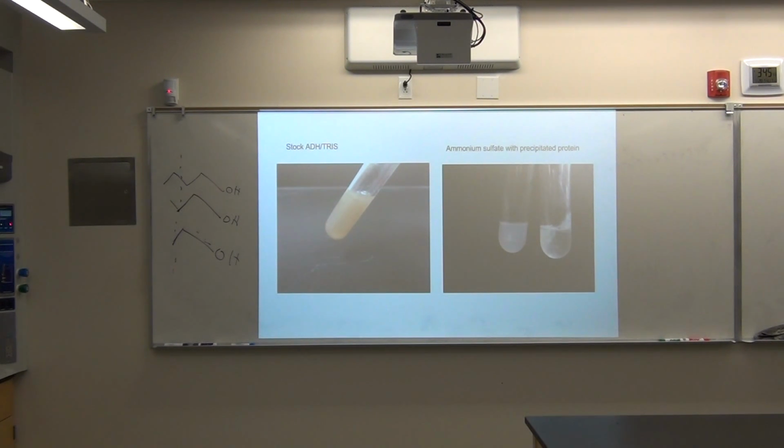That's why we have to run it in a refrigerated centrifuge, because the sheer friction of spinning at 19,000 times G or 15,000 RPMs heats it up, and that'll kill the enzyme. So we had to buy the $4,000 refrigerated centrifuge. That's why we did it, because it's more expensive to isolate.